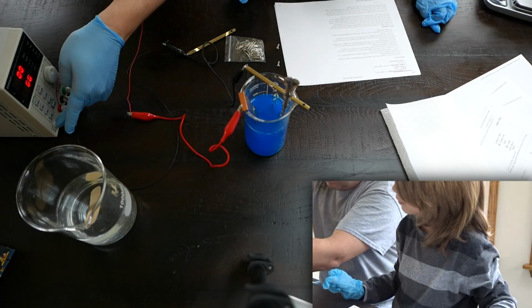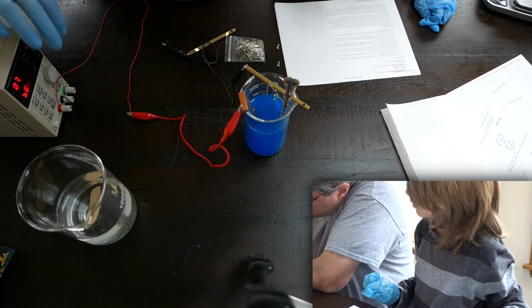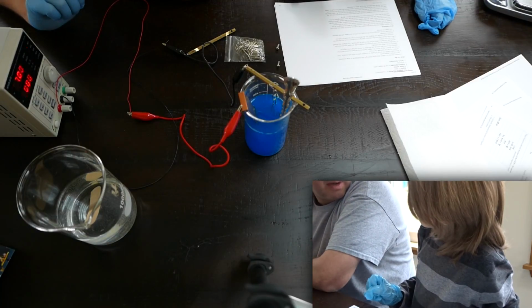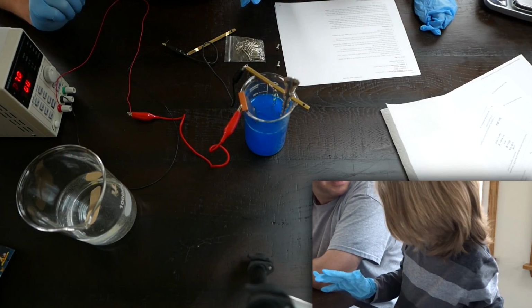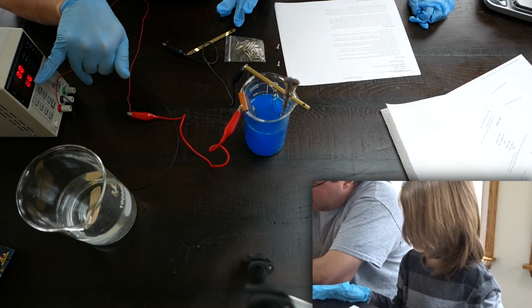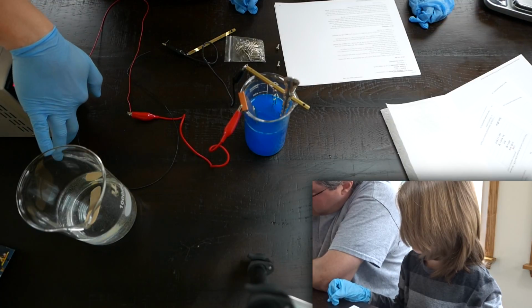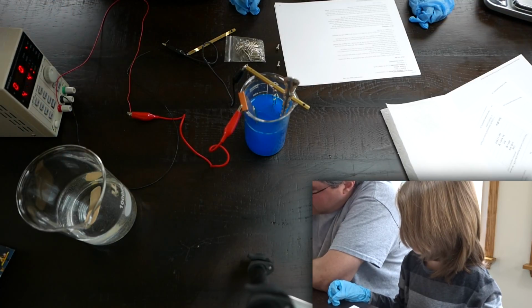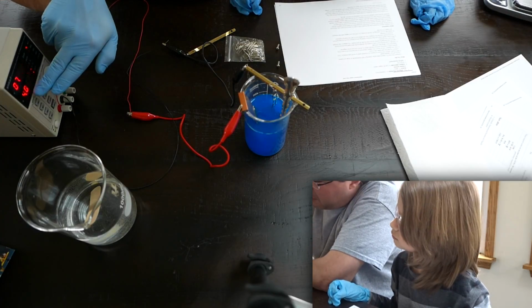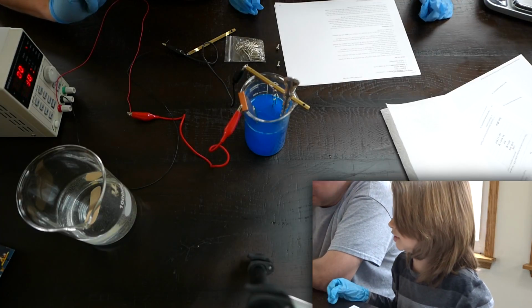Okay, I'm going to turn it on again. We have it set at 7 volts, 5 amps, so it'll kick off. Why are you standing? So we have it set at 7 volts, and if it goes above 5 amps, it's gonna kick. So, see what happens. I was really close because we had it set at 5 amps, and it's using 4 amps. And there's 7 volts.